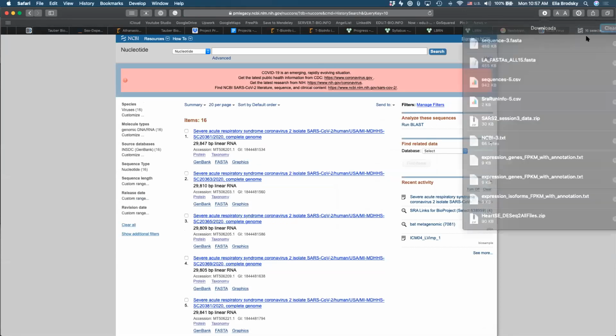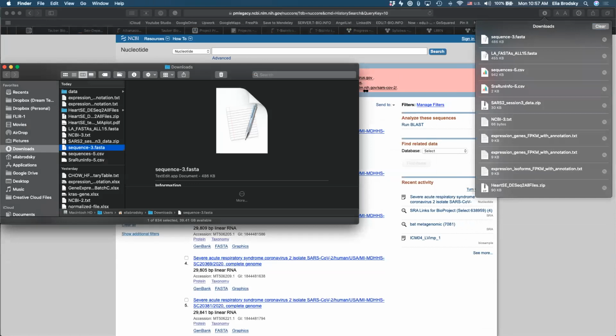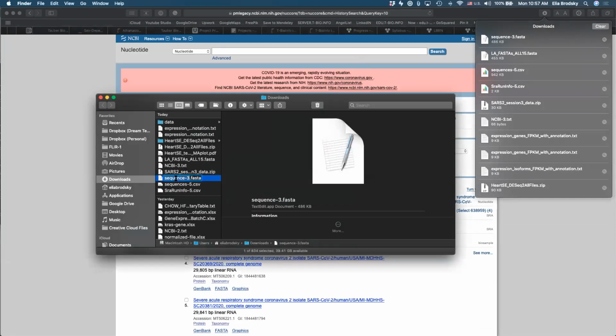Okay, so as I am doing this, you're probably thinking, okay, how is this useful for me? So can you suggest, some of you, what types of comparisons you would think would be interesting to make?